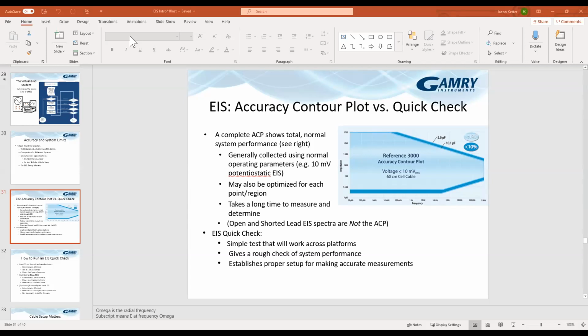Not a specific recommendation, unfortunately. There's a lot. Coatings is one of the bigger uses for EIS, and the reason is because EIS is very sensitive to capacitance changes. And so with coatings, you get water uptake that causes a shift in the capacitance. There's a quick check, REAP, Rapid Electrochemical Assessment of Paints, which combines EIS and looks at water uptake and combines that with the cathodic disbonding to get an estimated time to failure.